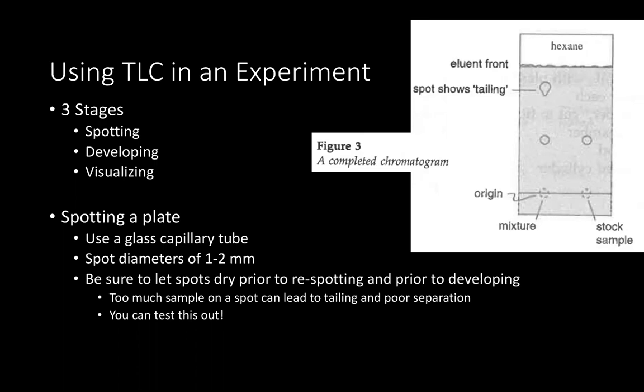You also need to spot very gently because the silica on the plates can actually chip off pretty easily, and you don't want to damage that silica. It interrupts the ability of your material to move up the TLC plate if there's any chipping on the silica gel.